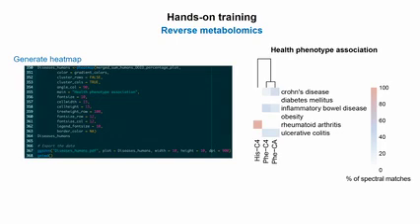Would you boost the 0.6 to go to 0.8? Because if they're collected from the same sample, one cannot be from cyanobacteria and the other from gut microbiome. So have you adopted, or would you like to adopt, a re-ranking or boosting of the possibilities to make more sense of the overall result?